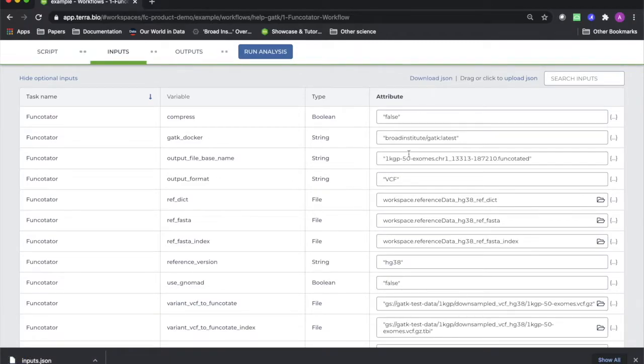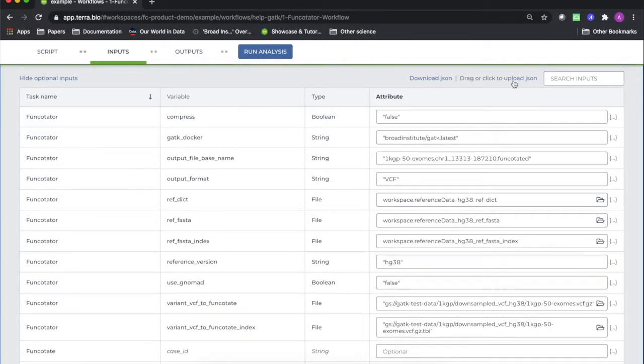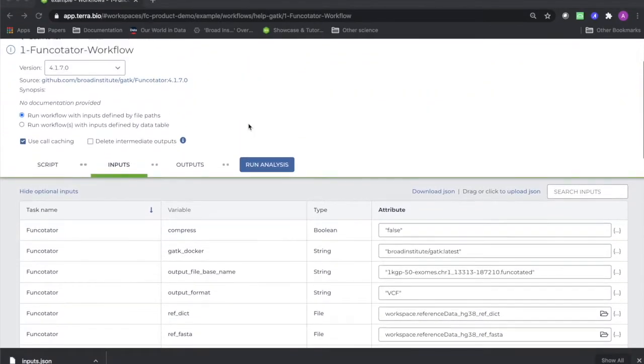When you want to use a configuration that you've saved as a JSON in the future, simply upload the JSON using this button in the workflow you're configuring.